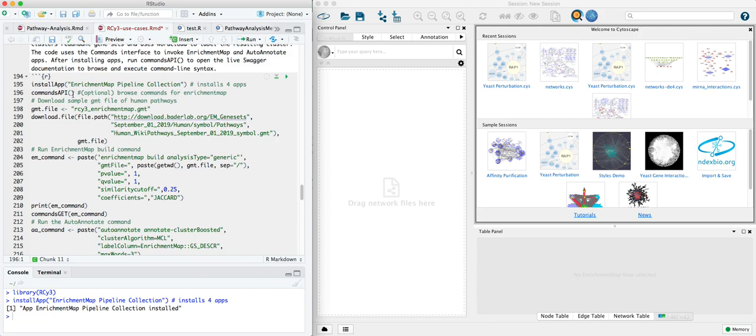Optionally, you can run the second line to open the Swagger docs and explore the Enrichment Map commands that are available. We're going to proceed with this particular use case and set of commands. So the first step is to load some results.